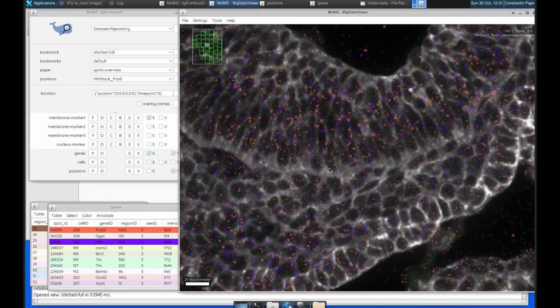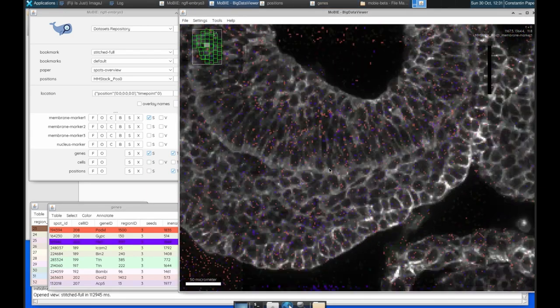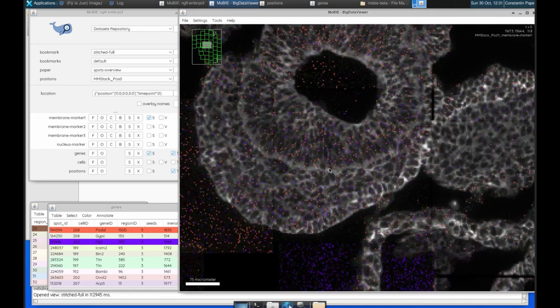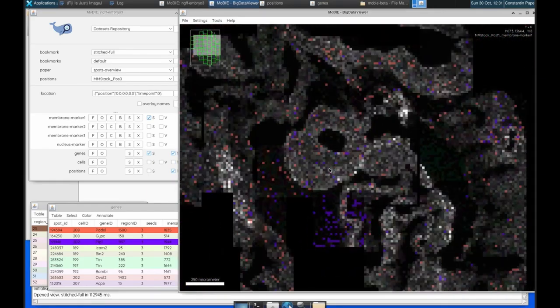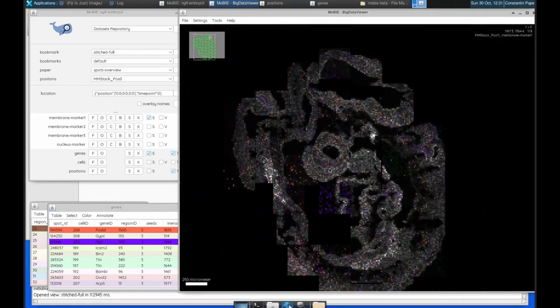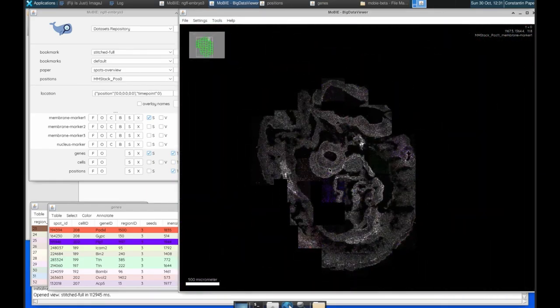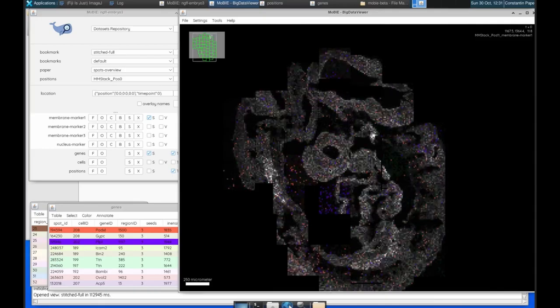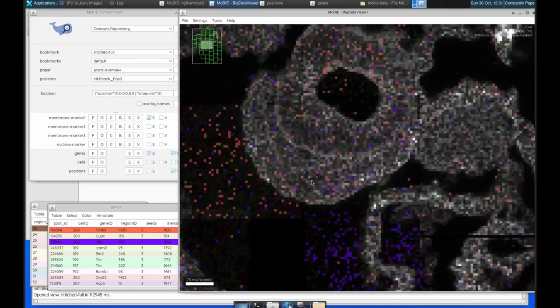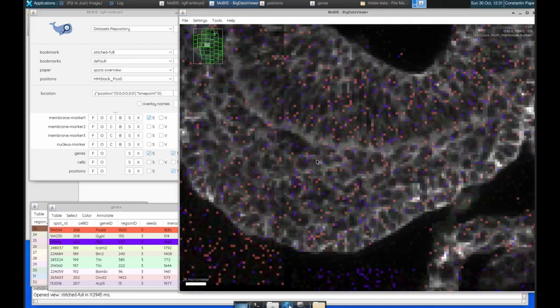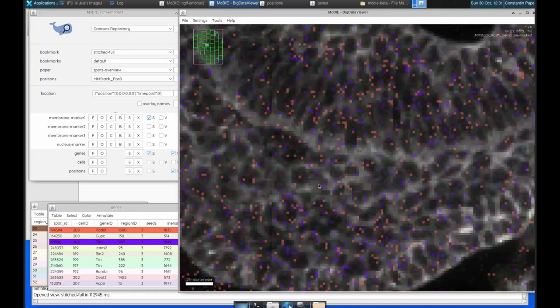So we can visualise the spots well, we can see them in the whole dataset, we can colour them by their specific gene IDs, but still the point is that there are so many spots, so many locations, it's hard to actually make sense of that visually.